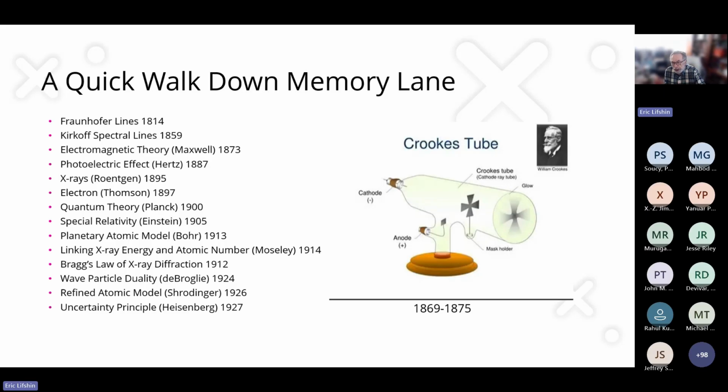But if you put a magnetic field there, electrostatic field, you could deflect it. And it's kind of funny when you look at this device, because you see within it the embryonic form of the cathode ray tube, of the scanning electron microscope, of a whole bunch of stuff, of radar. And this is really kind of amazing how this relatively simple experiment led to so many important developments.